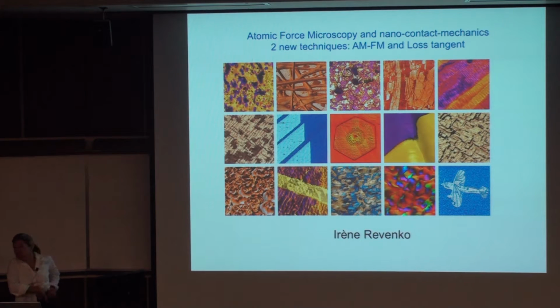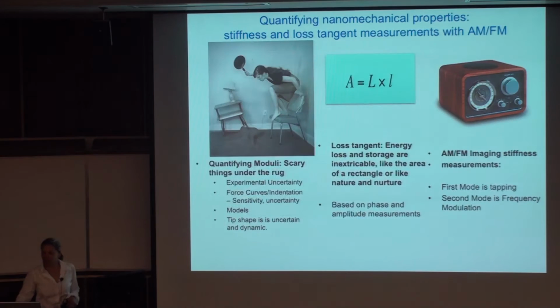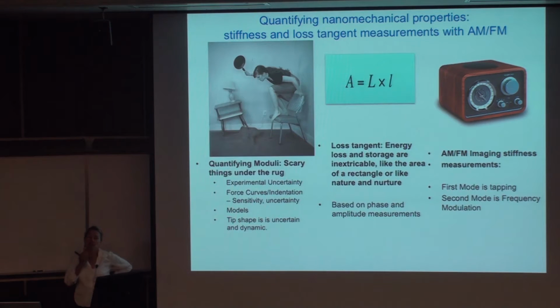Because the talk is relatively short, I really cannot go too much into detail, and there will be some assumption about what you already know, especially about AFM. So the motivation with this new technology called AM/FM is that a lot of people in the AFM world want to do mechanical measurements with their AFM. It's a big trend in all kind of areas. So of course, that's very exciting.